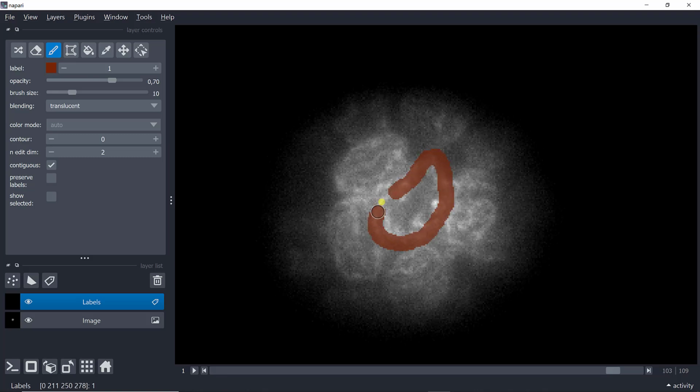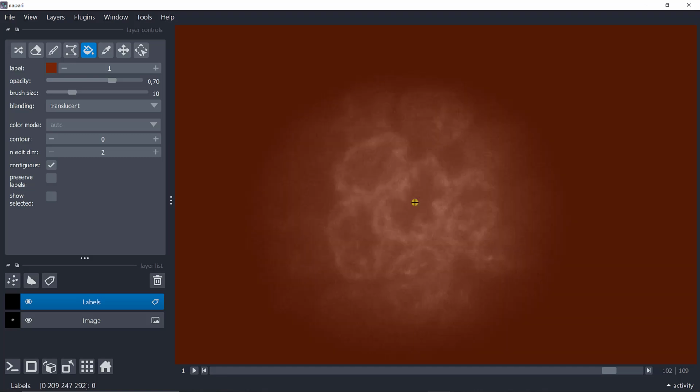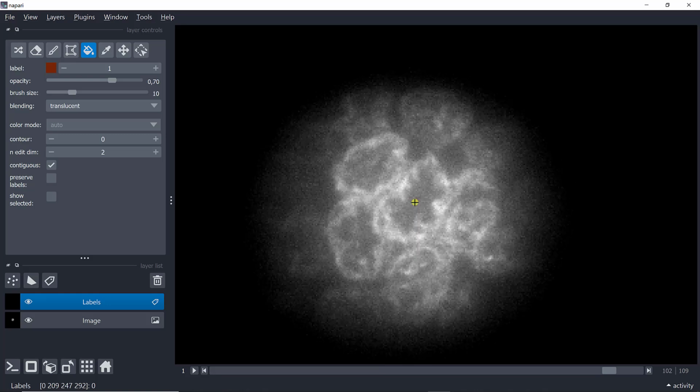And so I can, again, do something like this. If I don't want to fill in by hand, I could change the size of the brush, but I can also use the fill bucket. As I'm in 2D and this is well defined, if I do this, now it's going to fill the interior, and I can go to the next. Now be careful, if I use the bucket directly, here I'm filling the entire image, so you can do Ctrl Z to undo it, and you can use the numbers. So if I do 1, it's eraser, 2, it's the brush, 3, it's this.